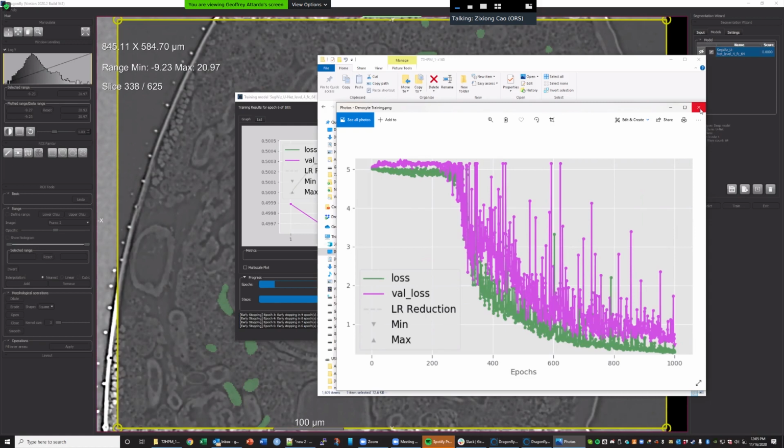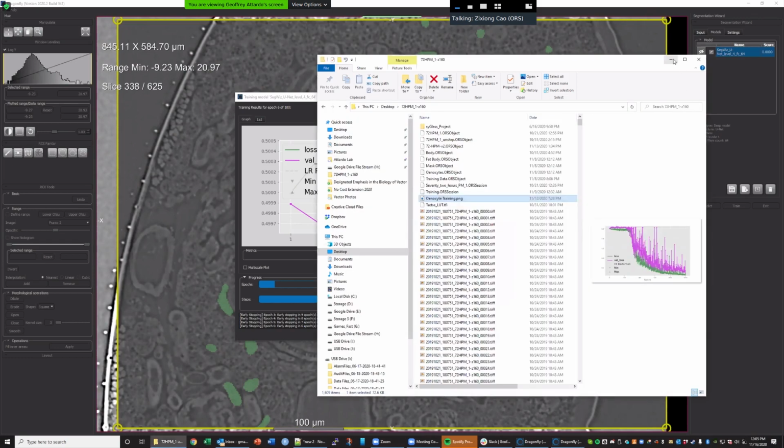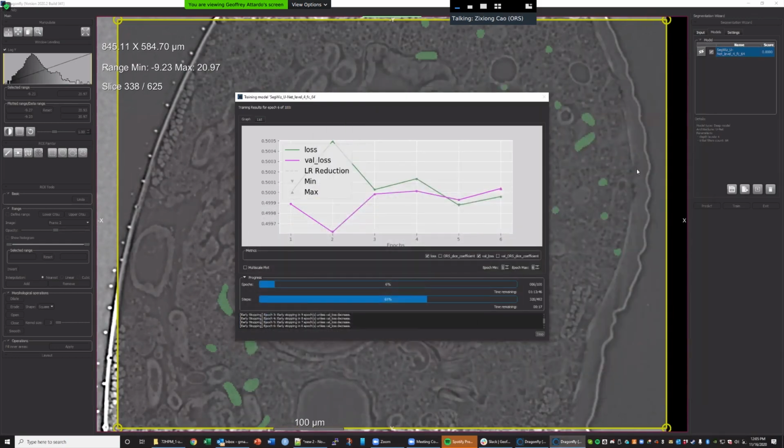But it should not be totally bad. If it doesn't predict anything, that doesn't sound good to me either. Even with overfitting, it should do some prediction, maybe not as perfect as the training set, but it should do something. Yeah, I was expecting to see something, but it seemed like everything was background. It wasn't even that it was inaccurate, it just wasn't doing anything. Right. I think there might be something wrong, other than the overfitting issue, might be some other issues.